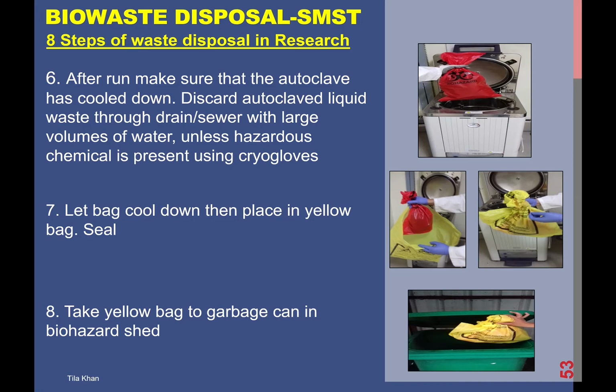And then you take this tied yellow bag to the garbage can in the biohazard waste shed, and then you are done with your steps. And then the bio waste disposal company will come and pick up your segregated waste to the final disposal site.